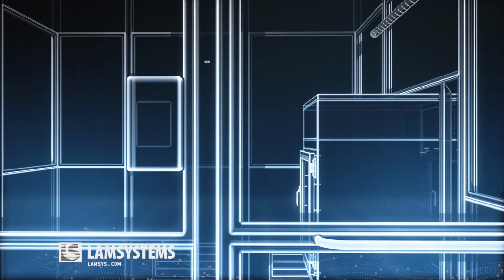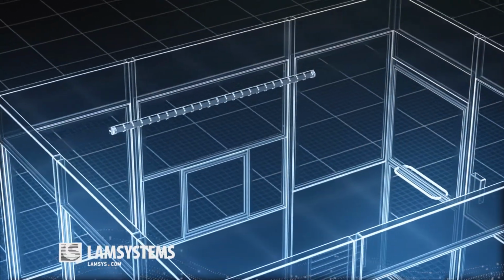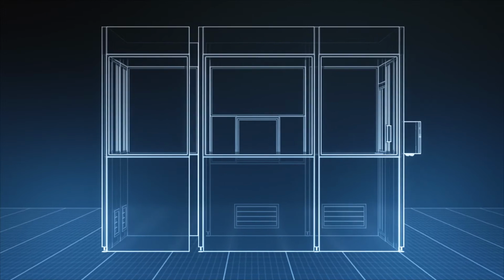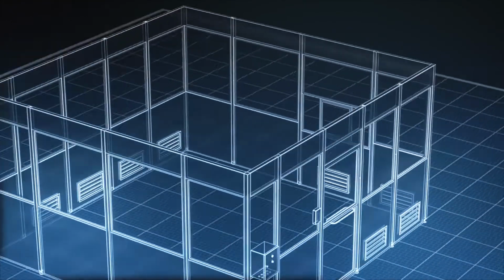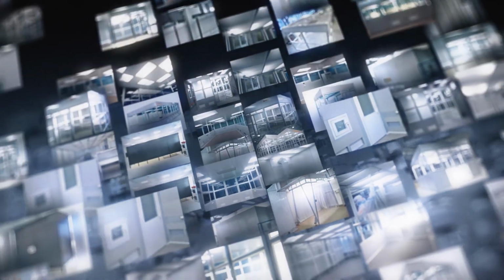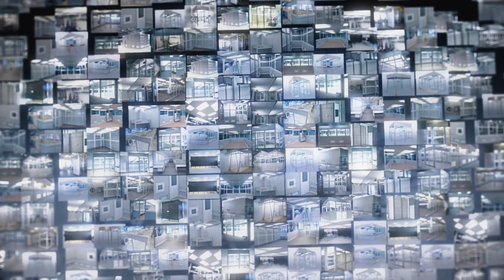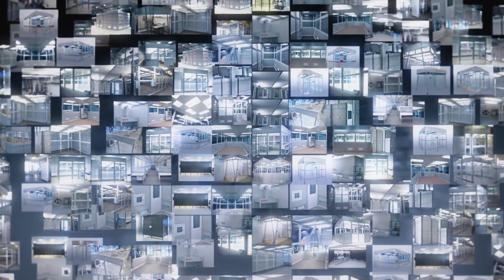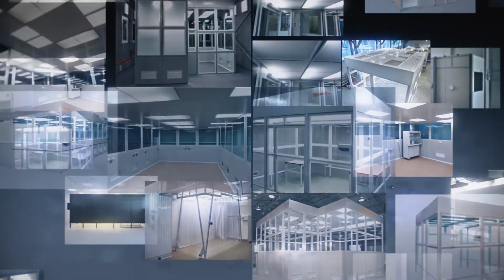The functional possibilities of clean zones are not limited to the above options, since each project is customized based on technical requirements of a customer and thorough processing of all the technological process specifics and operating conditions. The portfolio of our company accounts for about 500 clean zones, none of which is identical to another. More than 20 years of experience in the area of clean room and clean zone engineering allowed our company to develop its own unique technologies and to create a team of highly qualified specialists that are able to solve the most extraordinary problems.